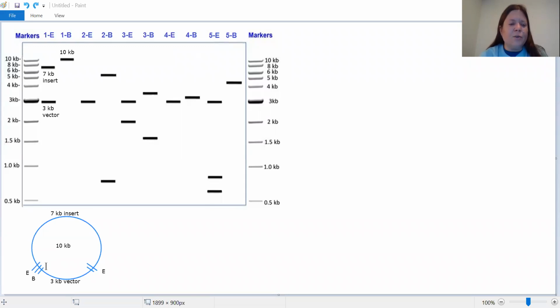So of the 2 primers, we know that the T3 primer binding site is near the BAM-H1. We know that the T7 primer binding site is on the other side. And the reason I've put this on the inside of the circle rather than the outside is just that there was more room there. It's not because it needs to be there for some reason. So that would be a complete map of plasmid 1.